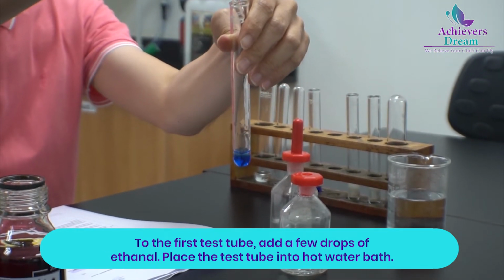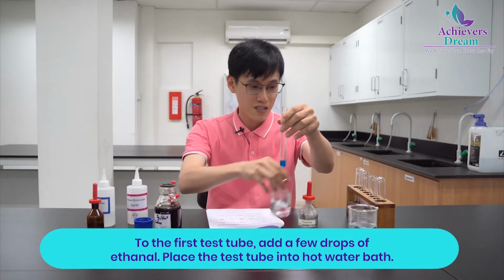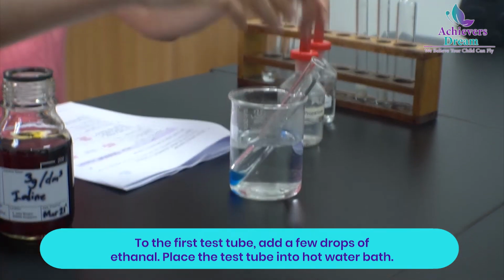There's no precipitate at the moment because the oxidation reaction needs energy. So I'll be placing the test tube in a hot water bath right here.